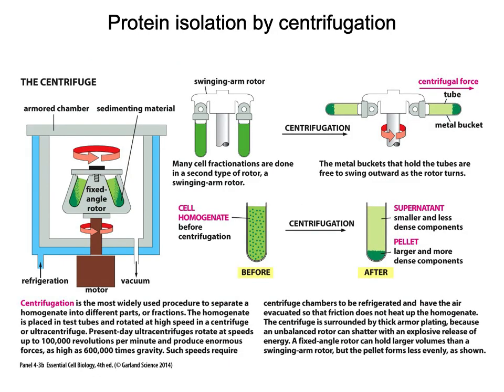Okay, and the reason why we're going to be centrifuging is we want to make sure we're isolating proteins. If we think about our bodies, we're made up of a lot of water, and same thing with the cells. And so we're not looking to collect all of that necessarily. A lot of times all we want to do is look at the protein fraction, right? And if you look at the middle of this figure, we have this homogenate before centrifugation, and you can see all that liquid and all that material in there.